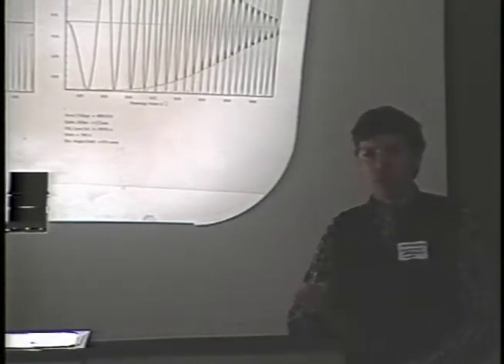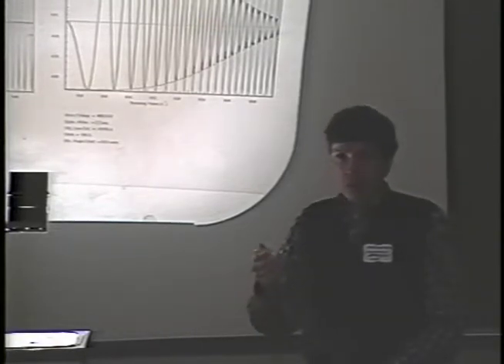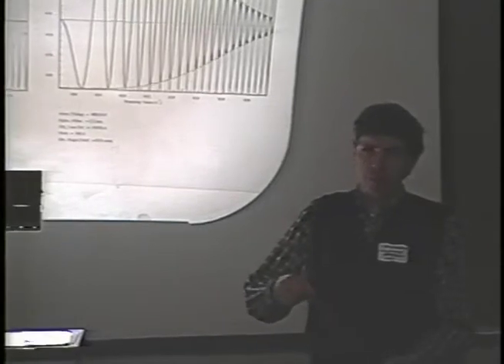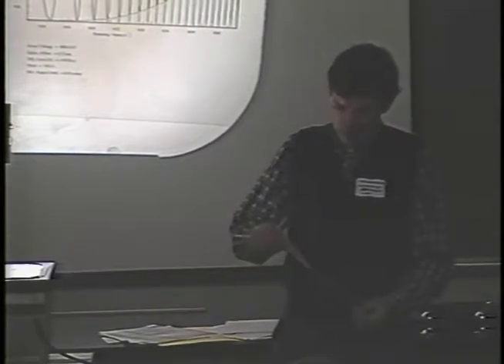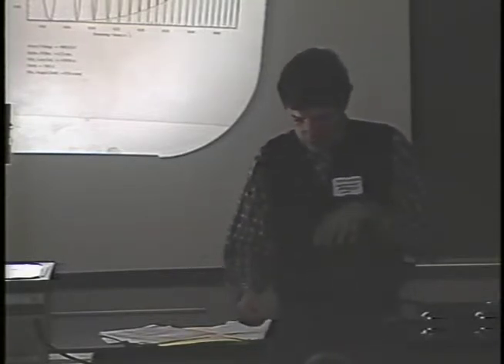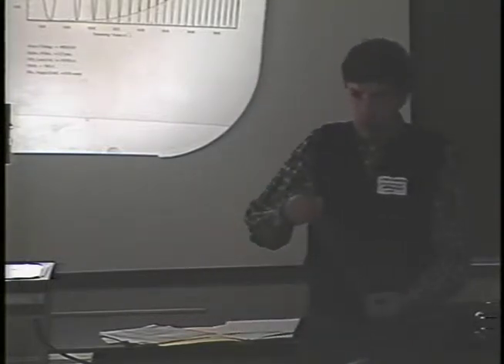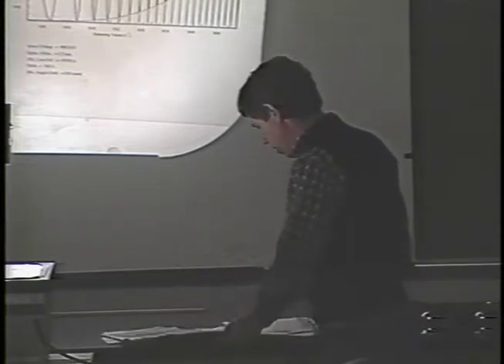As we tilt our specimens, there are 2 things that happen. One, this vibration perpendicular to the plane of the grid actually still occurs, and it's with the tilted specimens that we have the strongest evidence for that motion, and also where it gives us the most problem. Now, if you're looking down on something that's moving up and down, you're really not sensitive to that motion.